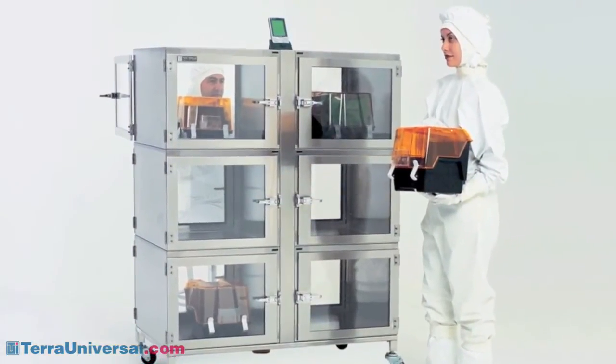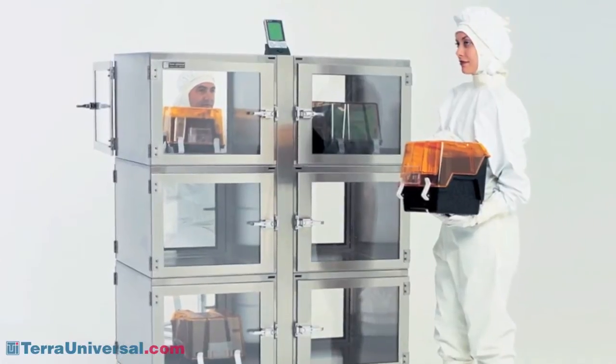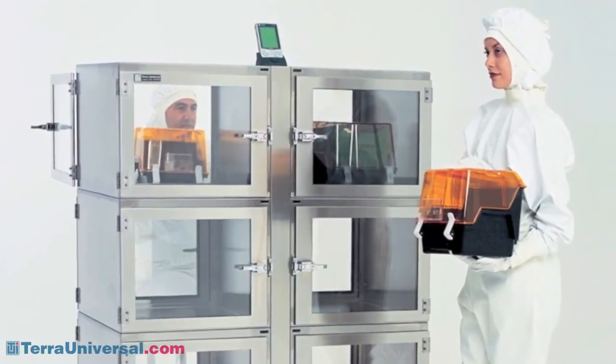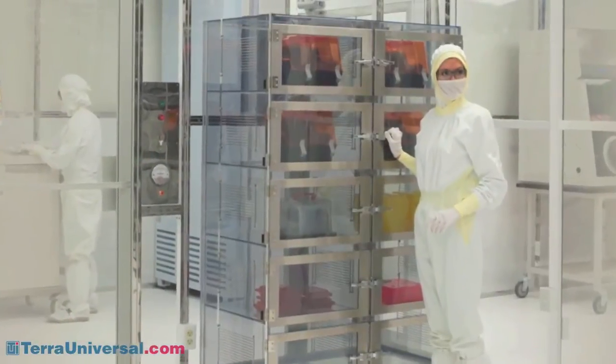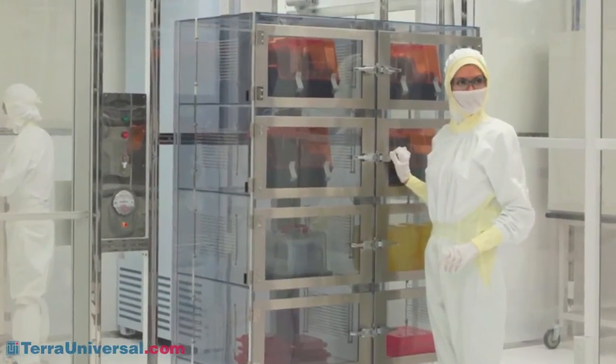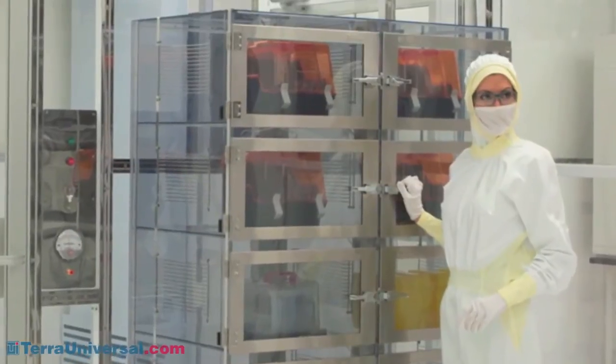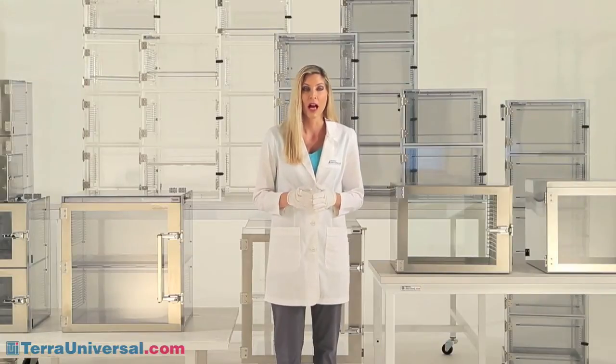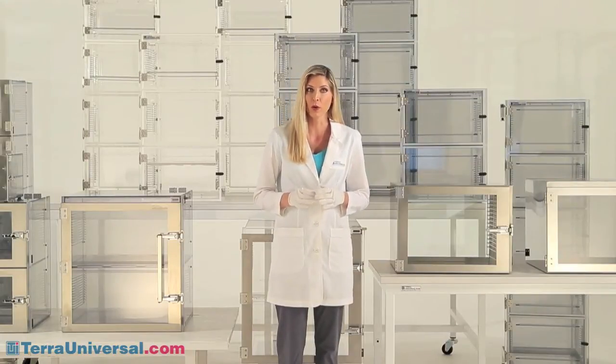One obvious difference between these two broad categories is durability. Stainless steel stands up to wear and tear better than plastic. However, Terra's extensive use of stainless steel components, even in plastic desiccators, minimizes this difference. The principal question to ask when selecting a chamber, then, is this: how critical are your moisture requirements?